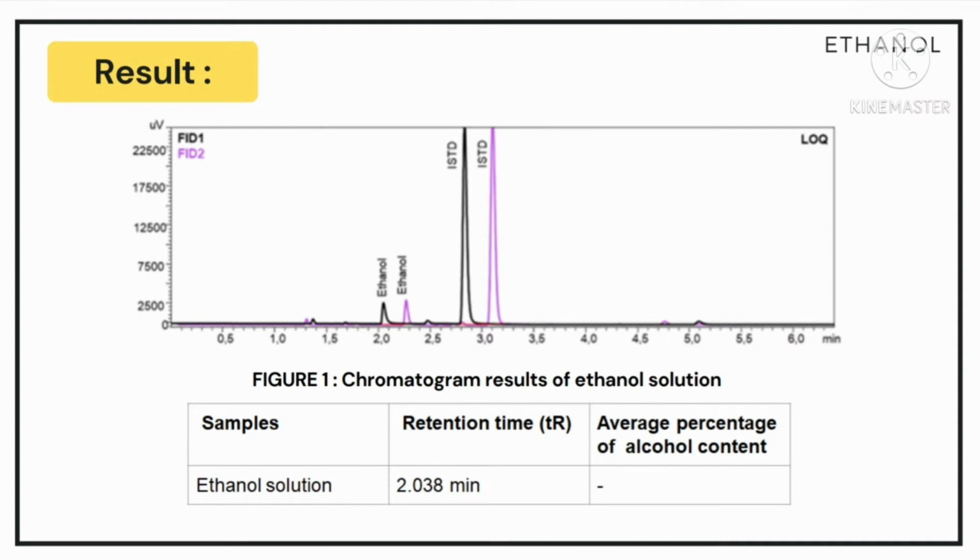So now I will be discussing the results and discussion of this experiment. Figure 1 shows the chromatogram result of the standard ethanol solution. The retention time of the ethanol peak is at 2.038 minutes.